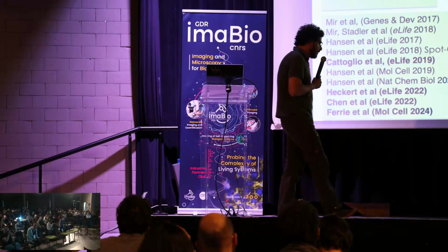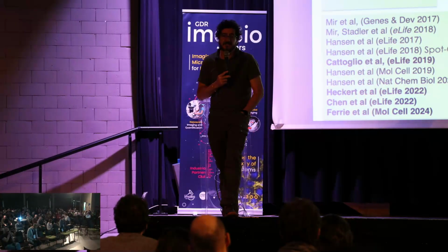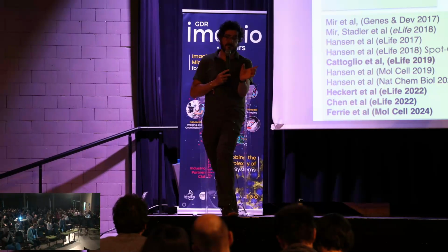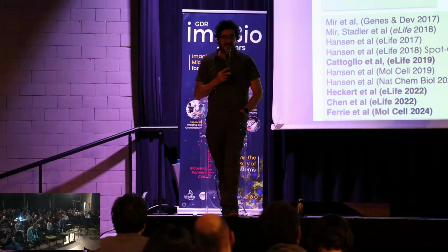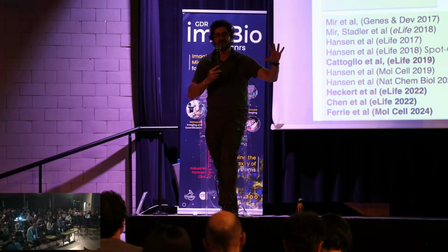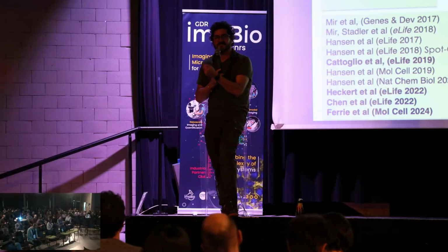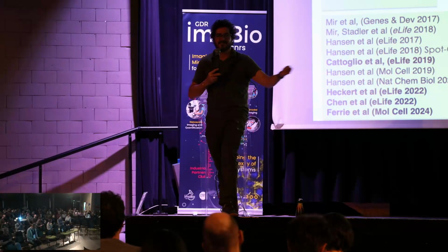So what we have seen in different mutants, whether you increase the DNA binding affinity of the folded DNA binding domain, which very often are a few mutations away from binding far more efficiently, or changing the IDR, is you get into a system where they bind very effectively to DNA or to chromatin, but to the point where they don't make it to the target anymore because they bind basically to the first sequence they see. And so the balance we are playing in cells all the time is, I want to get to my target. So I want to bind specifically to my target, but if I bind too strong to DNA or chromatin in general, I'm going to be lost in decoy sites, right?